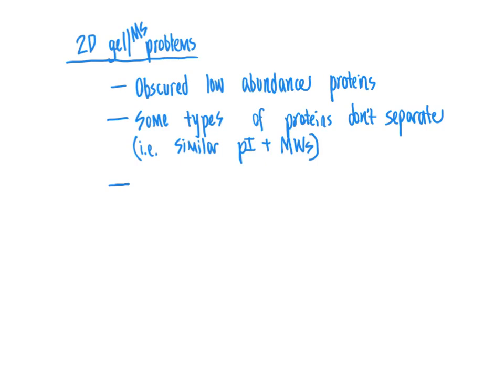Another issue in terms of identifying the proteins by mass spectrometry, we talked about how one could digest with trypsin or some other protease and identify what peptide fragments were present based on mass spectrometry, and then compare that to a database of protein sequences to find proteins that had that particular peptide sequence. But unfortunately, the databases have some limitations. The databases typically have the most common proteins, and so if you are exploring a totally novel, unstudied protein, it quite possibly is not present in the database.